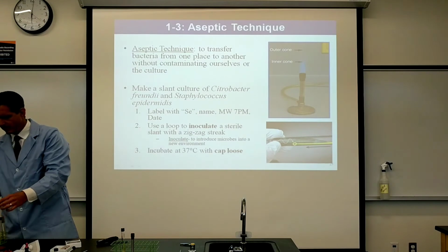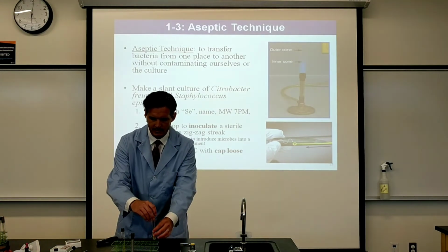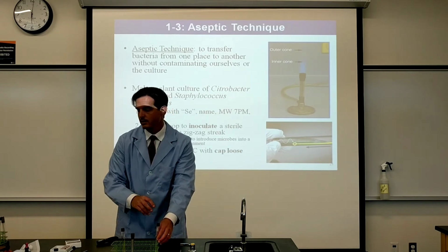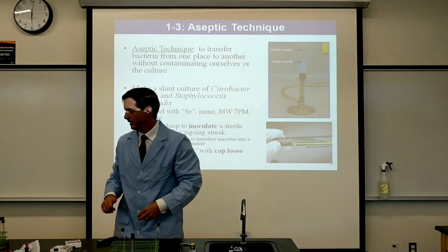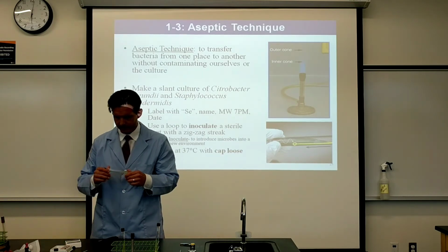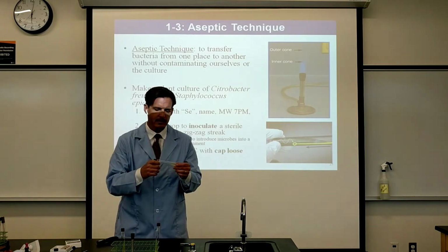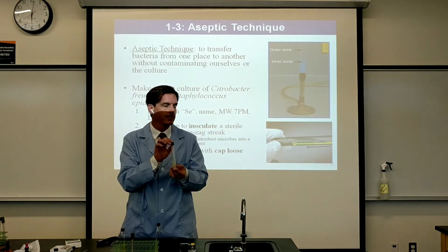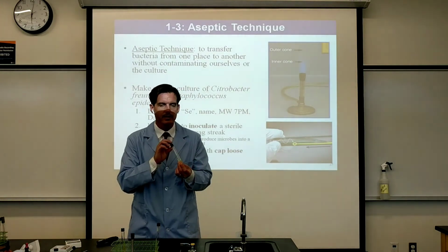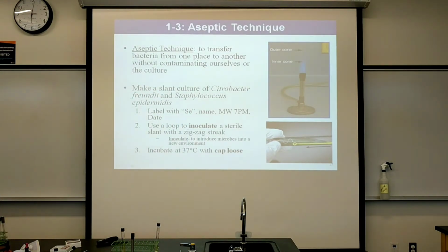And now I'm going to go ahead and make my transfer. So I've got the tube that I just labeled, and I have my bacteria that's already labeled C. freundii. If you're wondering what the bacteria look like already grown, I can switch back for just one quick moment.